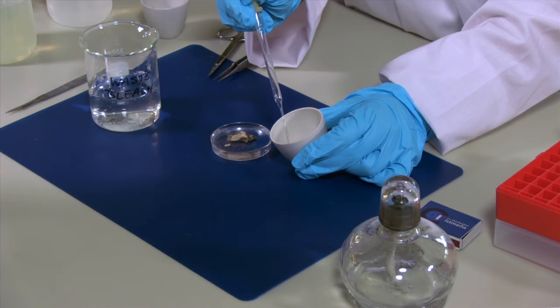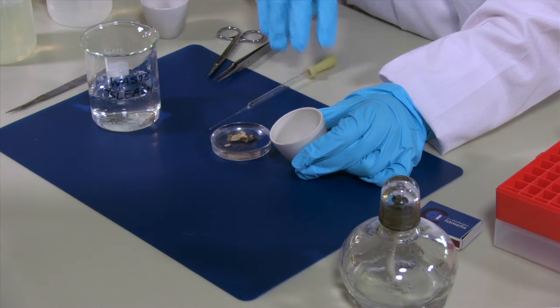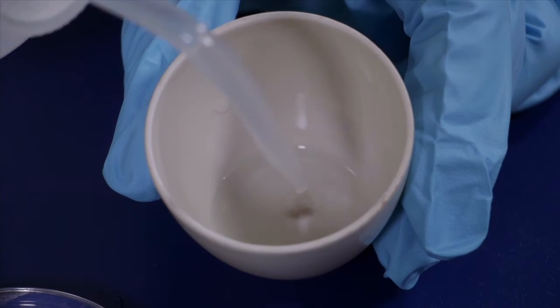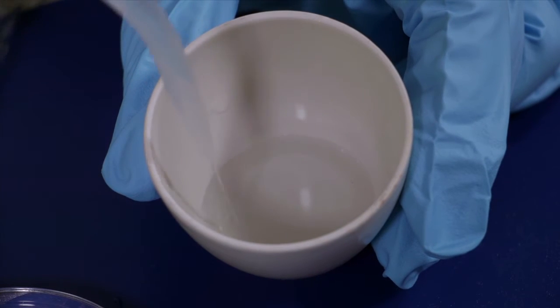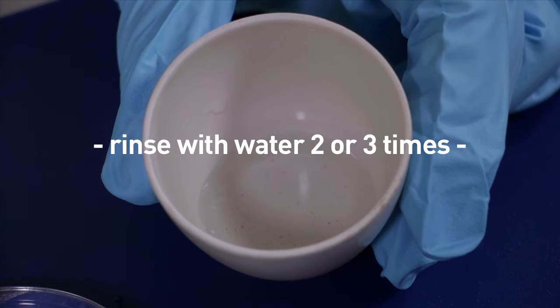After pipetting most of the liquid, you can wash them with water. Let them accumulate again on the bottom of the crucible for a few minutes. Then repeat this procedure two or three times to make sure that bleach is completely out of your preparation. Bleach will make crystals on the spicules if it dries out.